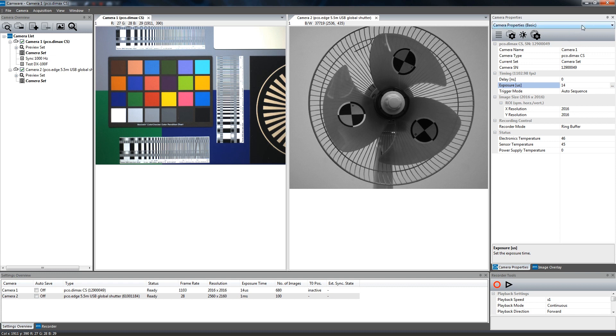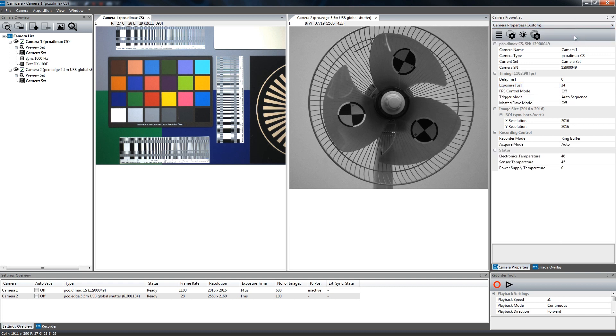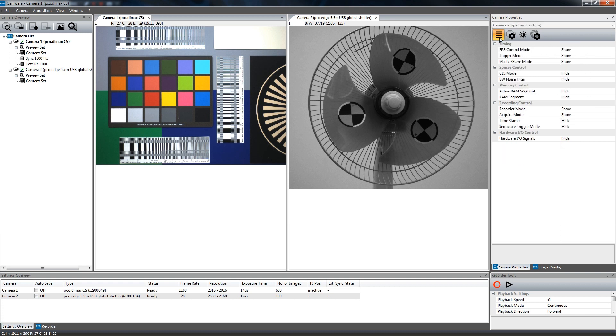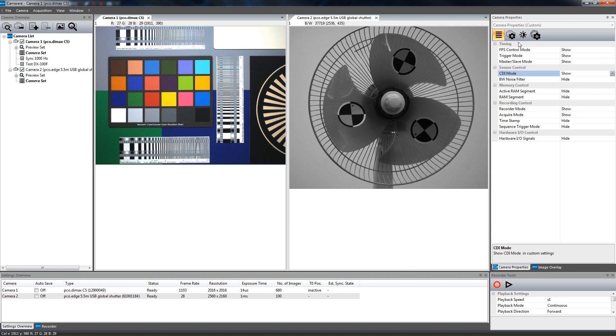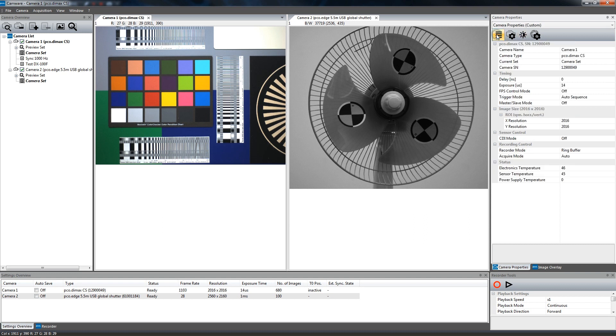The Custom mode allows you to select only the parameters that are relevant for you. By clicking on the Custom Properties button, you can choose which of the listed functions shall be shown or hidden. This mode is a smart compromise between functionality and clear arrangement.